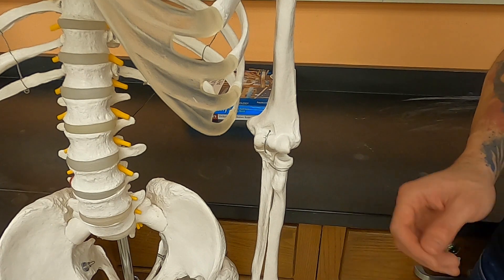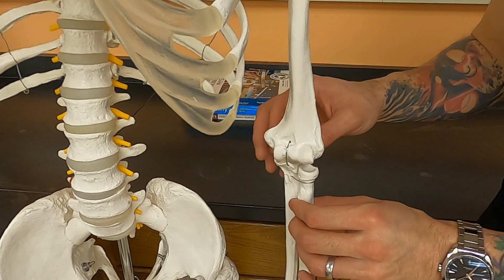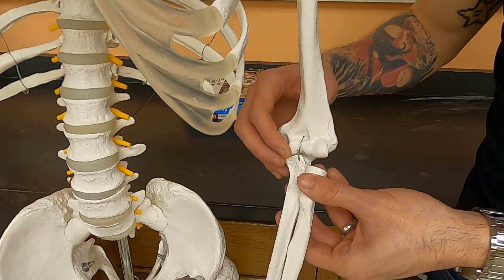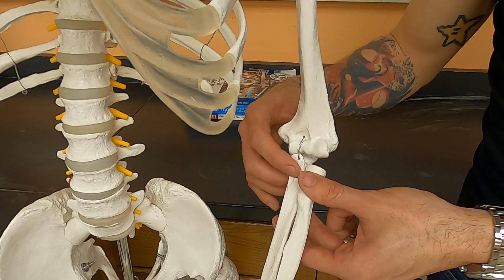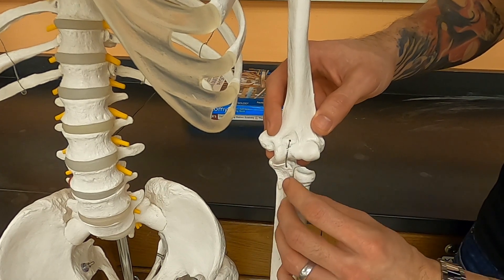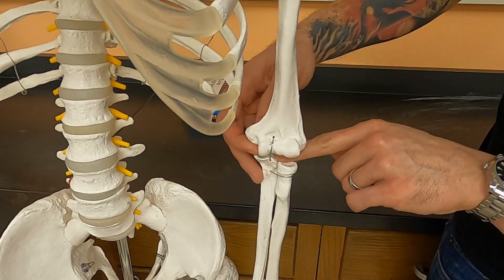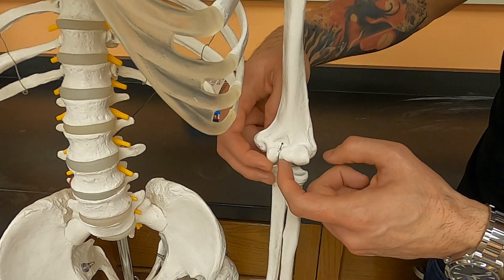Now here on our skeleton, you can see all of those same structures that we saw in the chicken bones. You can see the humerus, the radius, and the ulna. The medial epicondyle and the lateral epicondyle. You can see the capitulum that fits into the radius, and the trochlea which joins to the olecranon of the ulna. You can see the coronoid process here on the ulna, the radial notch where the radius fits in, and the coronoid fossa where the coronoid process fits.